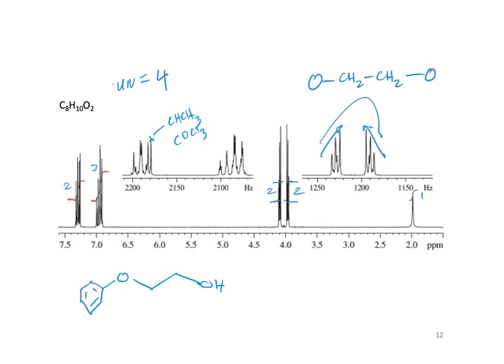But we use a deuterated solvent because we don't want a proton signal that's so massive from the solvent, because usually if it was just a protonated solvent, it would swamp out the rest of the signals. But in every solvent, if we get deuterated chloroform, there's a small amount of protonated chloroform in there. So that's what that is.